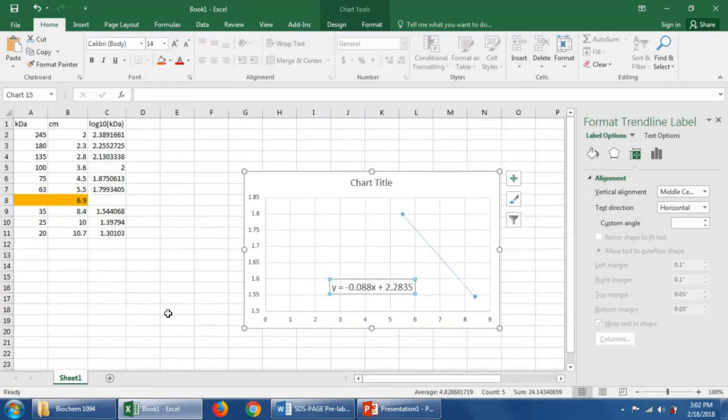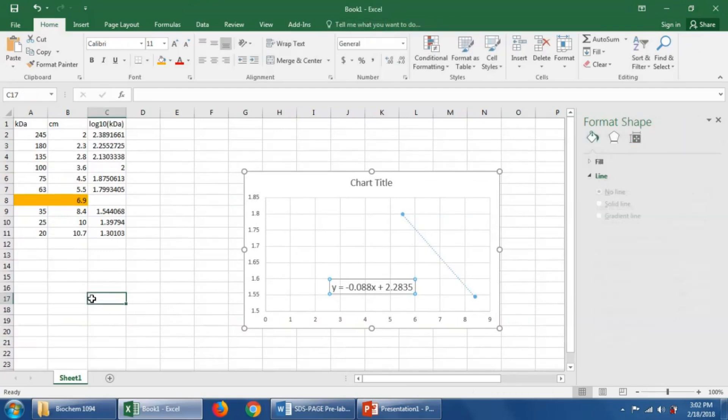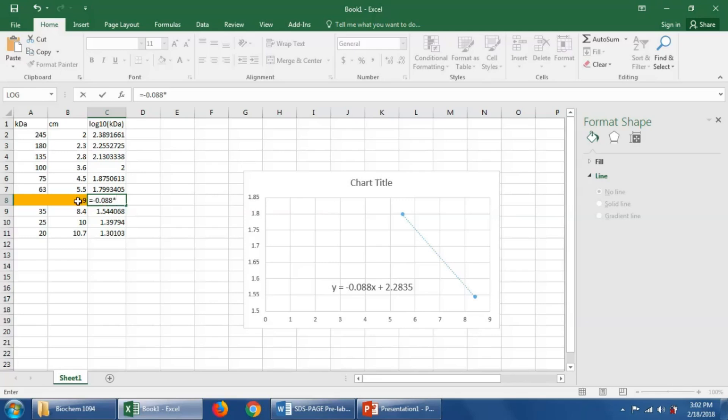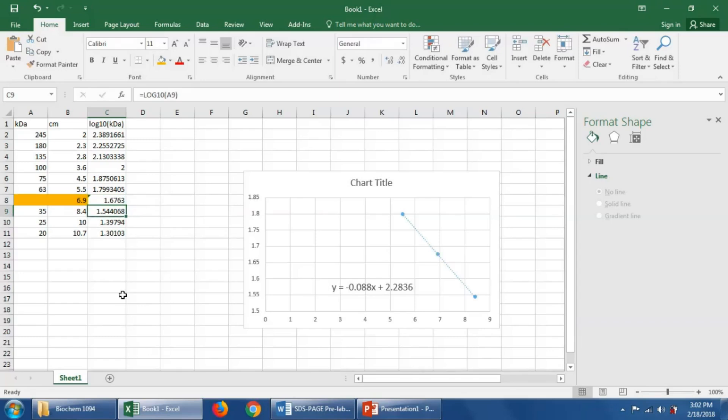We can come over here and we can say equals minus 0.088, and then we're going to say times 6.9. We can just click it, times 6.9, plus 2.2835. And there, we've calculated the log base 10 of the molecular weight.